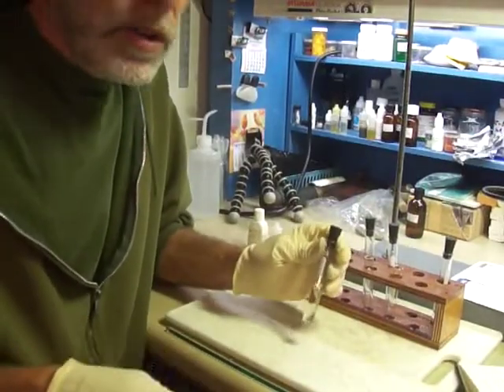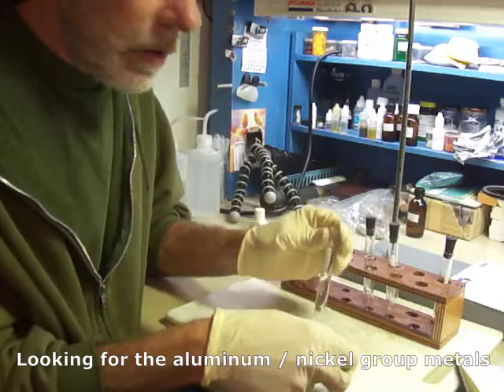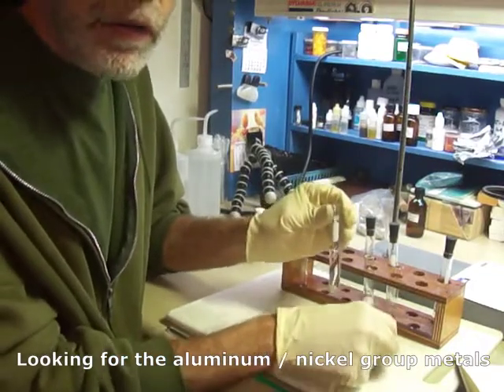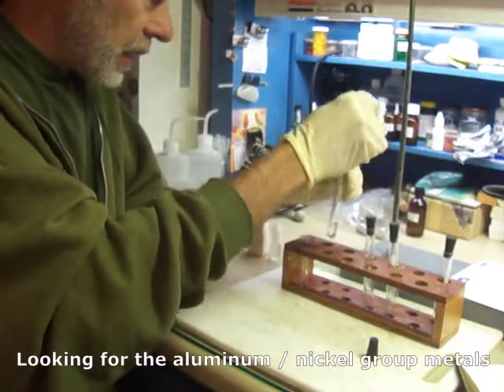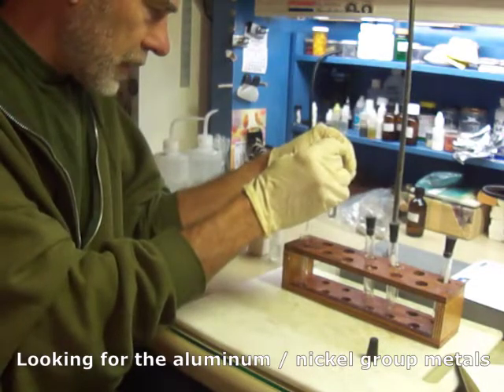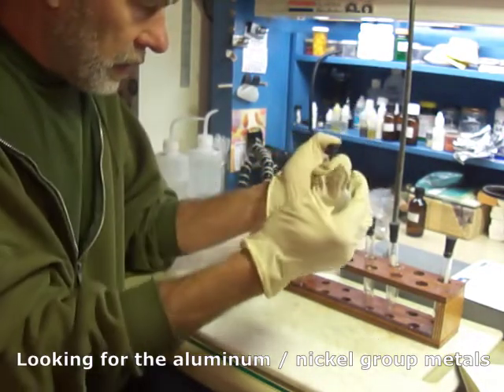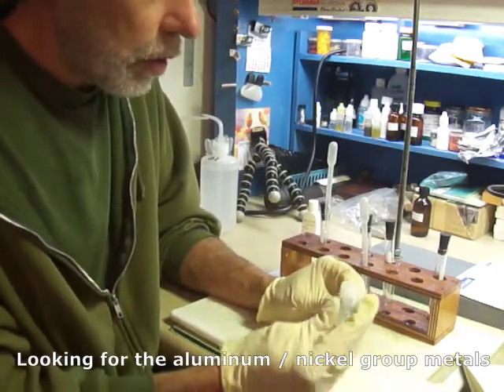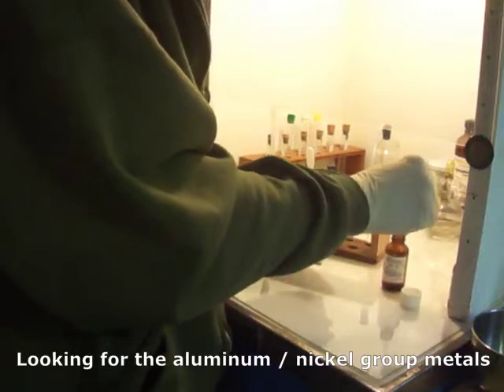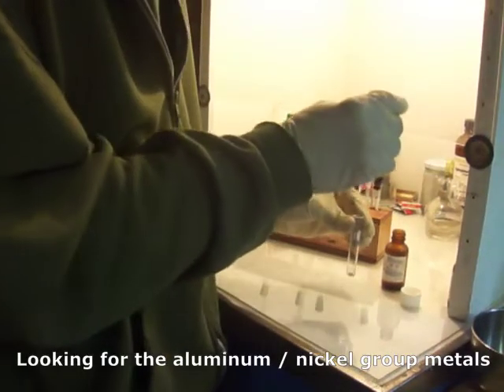I'm starting with fresh solution, otherwise we'd have to get all the old hydrogen sulfide out from the last step. So it says 3 drops, and I'm going to double it up to 6. That'll make things a little easier to see. We're supposed to add 4 drops of 2 molar ammonium chloride. Now we need to add ammonium hydroxide until just basic.